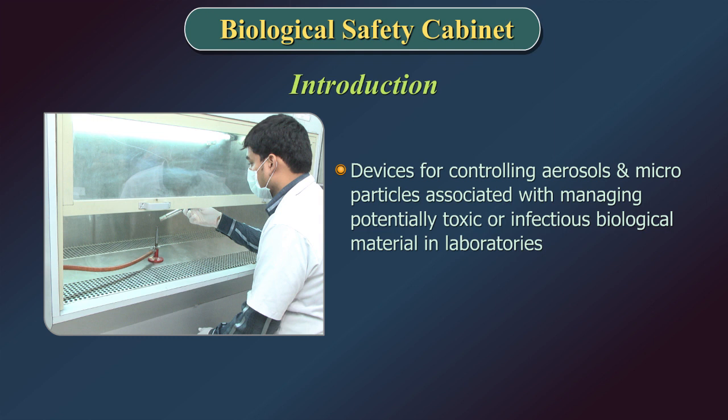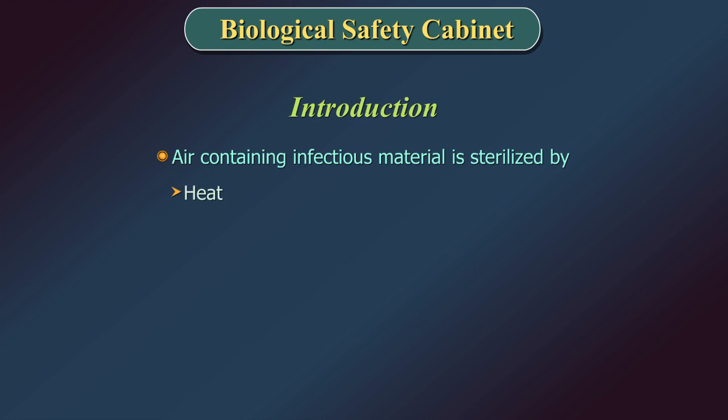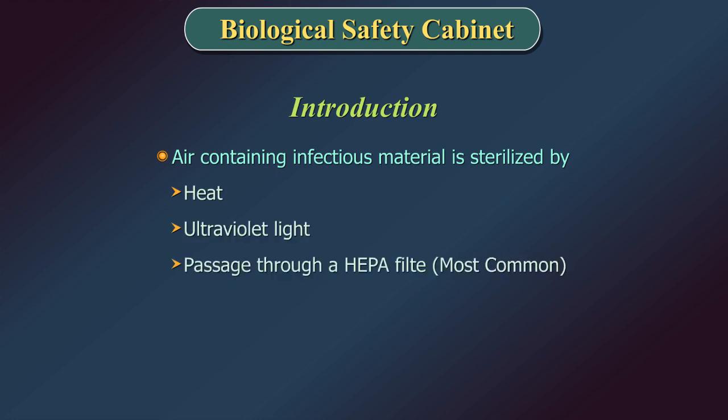A Biological Safety Cabinet encloses a workspace to protect workers from aerosol exposure to infectious disease agents. Air containing infectious material is sterilized either by heat, ultraviolet light, or most commonly by passage through a HEPA filter, which removes most particles larger than 0.3 micrometres in diameter.